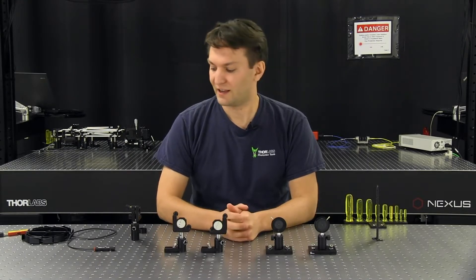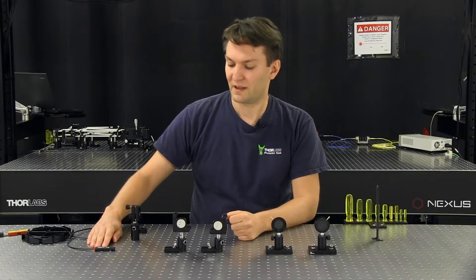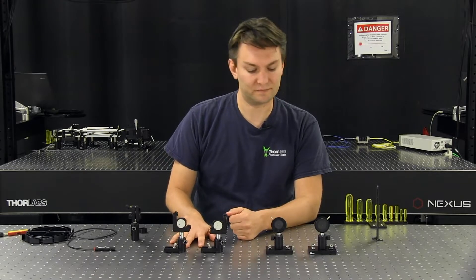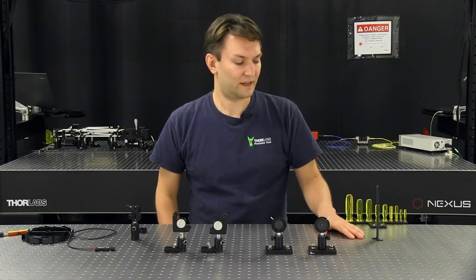For today's demonstration, I have a collimated laser diode package, a few kinematic mounts, two that have mirrors already mounted on them, two irises, and a ruler.